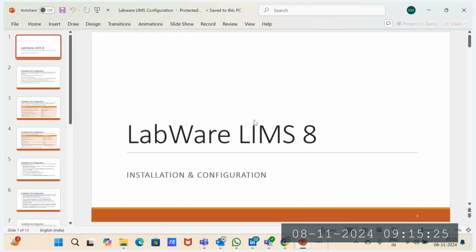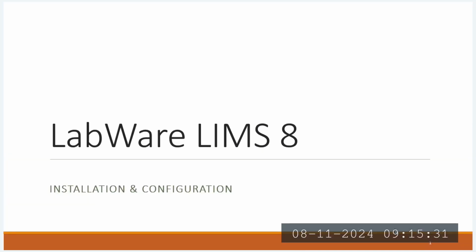I am taking a few examples of how these LabWare LIMS installations and configurations are going to happen. For your quick reference, I have some PPTs, and I will walk through these PPTs. But when we start our actual training sessions, we will be using the real-time application for further training sessions.